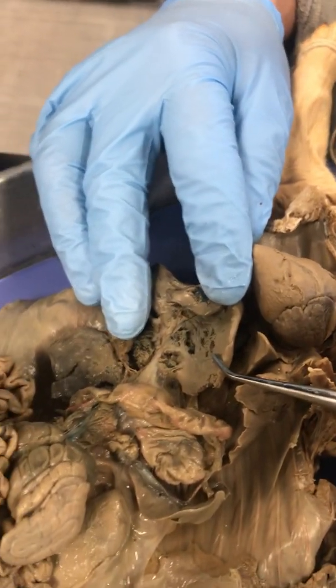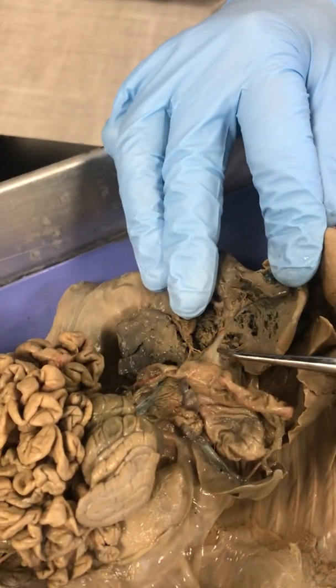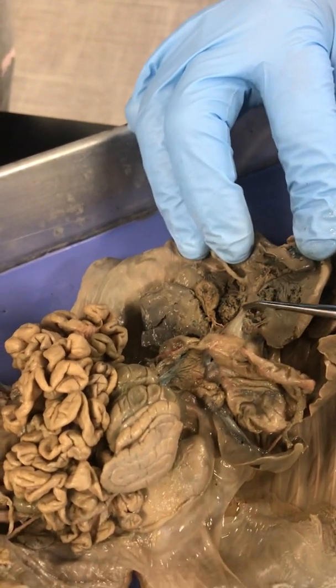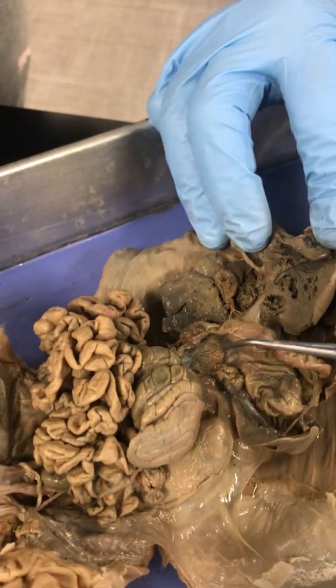And I typically don't try to isolate it. It's hard to isolate. As is, oddly enough, the hepatic portal vein. I used to do a lot of work on the liver, and for whatever reason, these pigs are just so hard to see the hepatic portal. So I never ask that either.